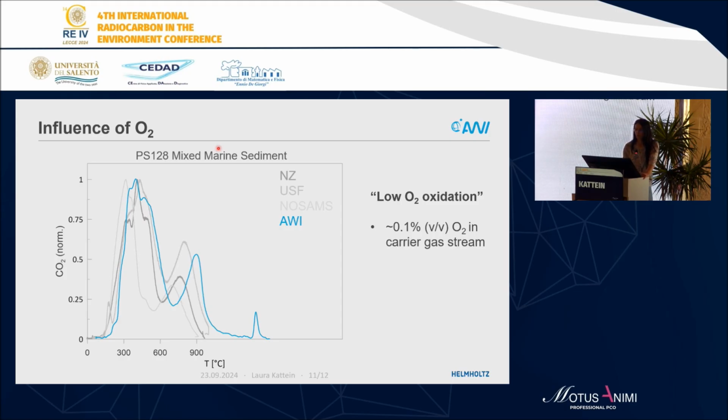It might not be so surprising to receive different results when you use 2 completely different methods like pyrolysis and combustion, but at least to me it was extremely surprising to see the magnitude of this effect already present at these low amounts of oxygen.